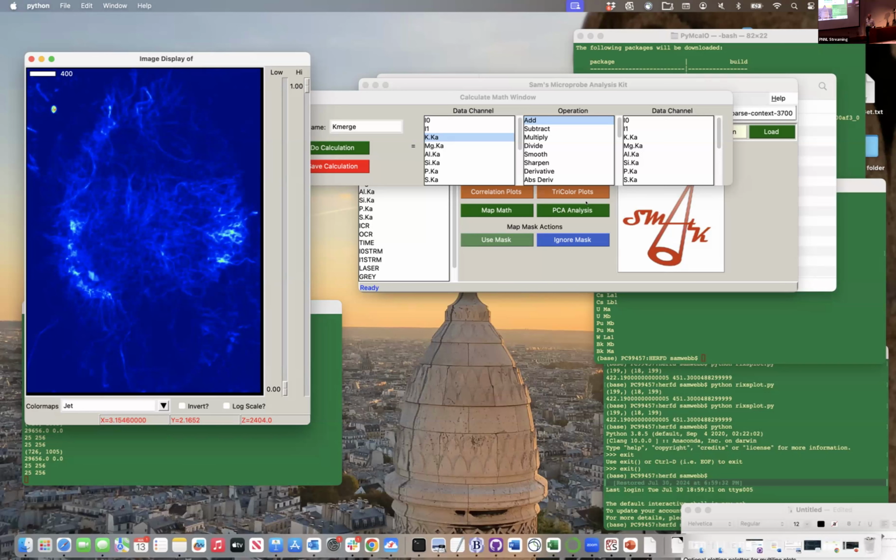And a different one, because you talked about the scale bars in the beginning. Is there a way to change the size, font size, or add micrometer? Yeah, so it does it in whatever the units of your data are, right? And so all of my X-ray data are in microns, and so it scales it to 10% of the view. So it's usually a nice, normal, not too in your face section, right?